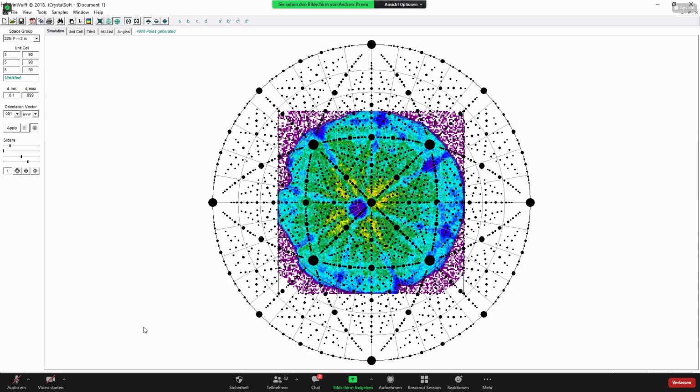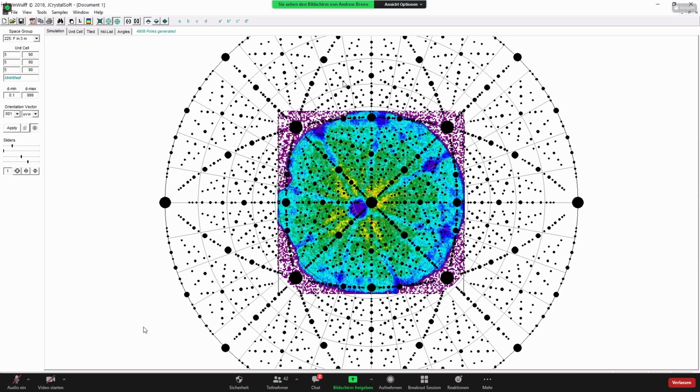Like I said, for this type of atom probe, the 3000, we're looking at something like 60 to 70, probably a little bit less than 60 degrees field of view actually, because it's even older. And I think I maybe overfilled the detector here. We can zoom in, and it's a bit hard to see, but you've got these great circles on the stereographic projection, and each one of these represents 10 degrees, so 20 degrees across the whole circle.